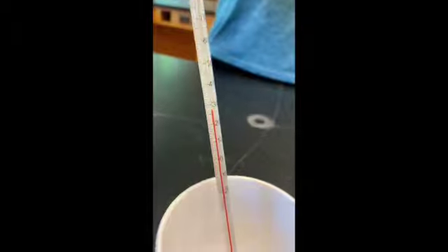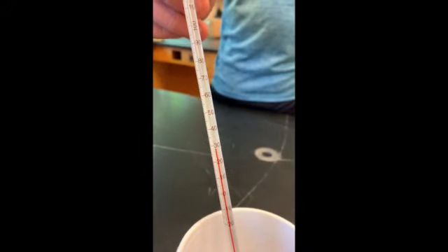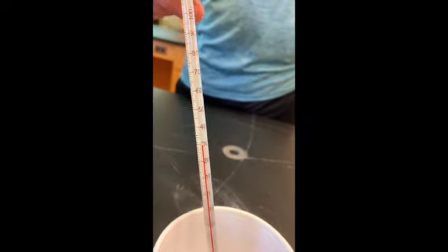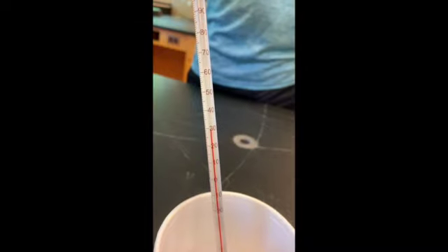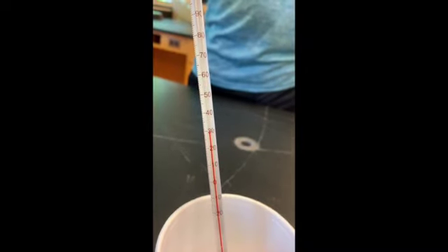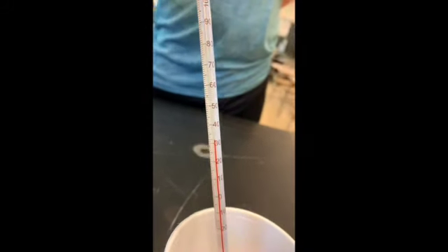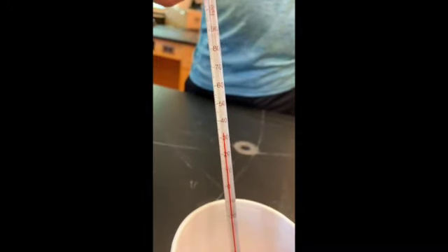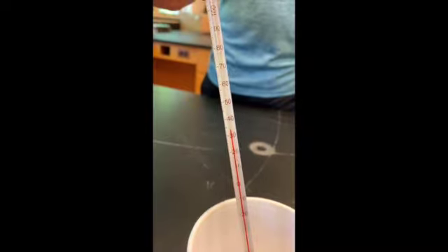You can hear it. You see the bubbling. We're producing hydrogen gas. We saw this reaction in one of our other labs. All right, hold that steady, and we're looking for the highest temperature reached. So we're going to keep looking at that thermometer. You can see the hydrogen gas is giving off, and you can see that temperature rise. Okay, and we are looking for the highest temperature reached.